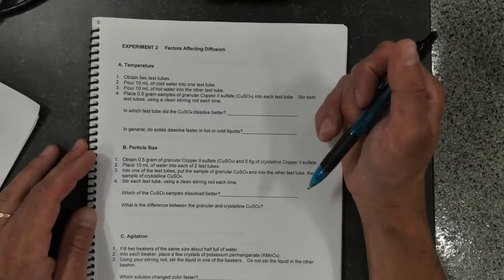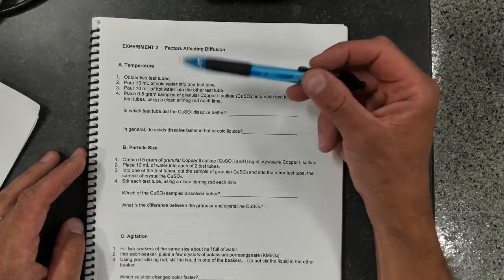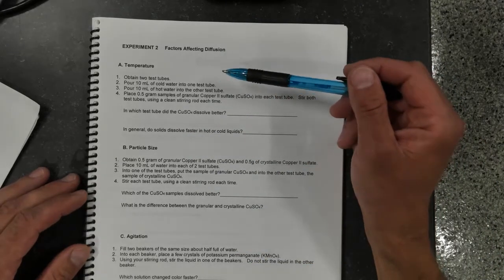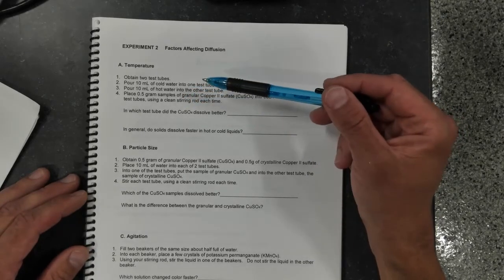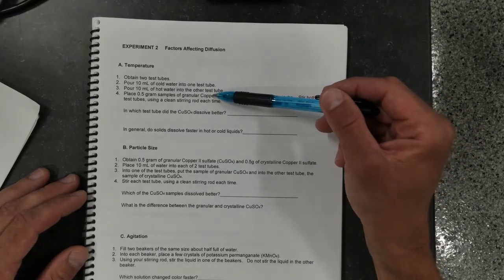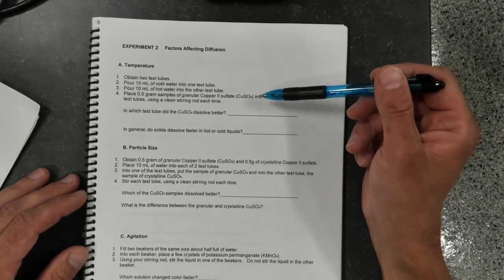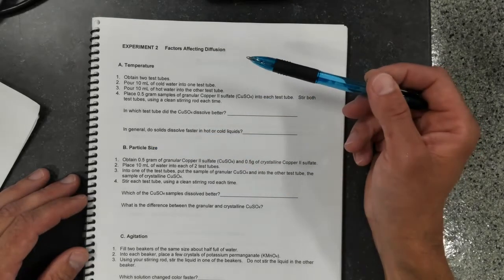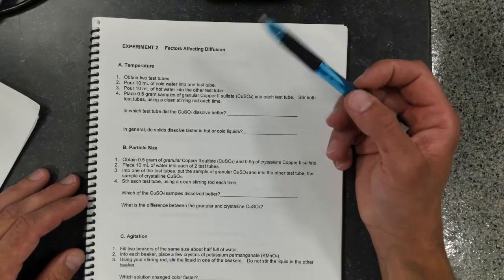So for the second experiment in lab number 9, we're going to look at diffusion. And we're going to look at 3 factors that affect diffusion: temperature, particle size, and agitation. In the first one, we're going to put 10 milliliters of cold versus 10 milliliters of hot water into 2 test tubes. And then we will put samples of granular copper sulfate into each tube. Okay, and we will stir and see how well they dissolve.